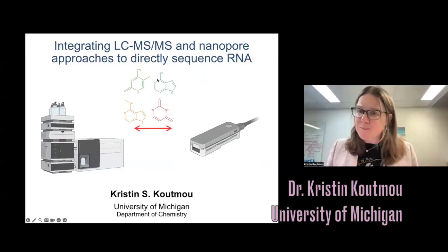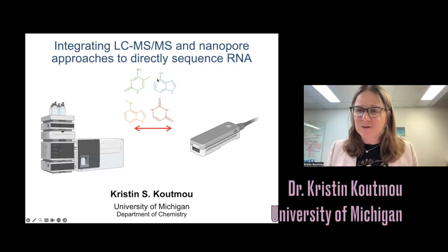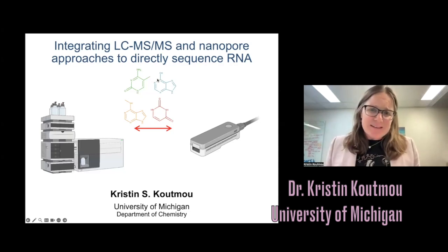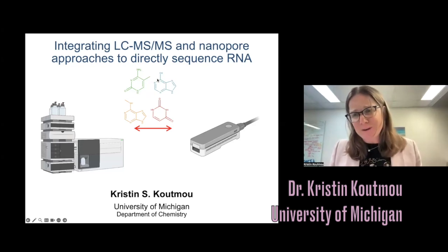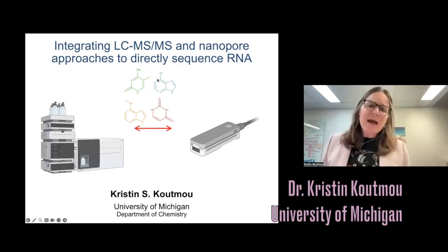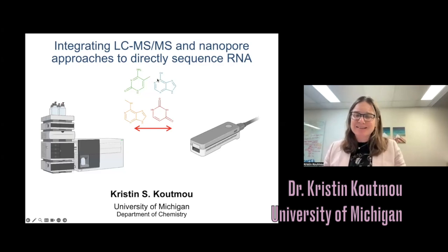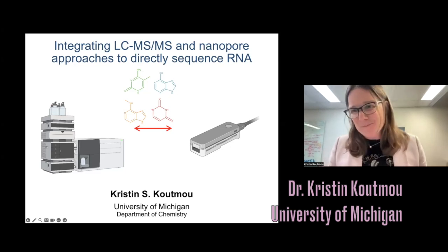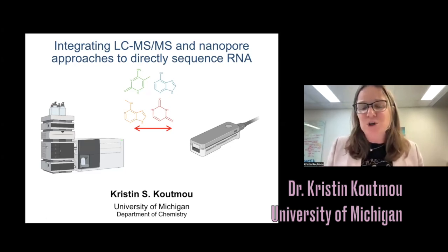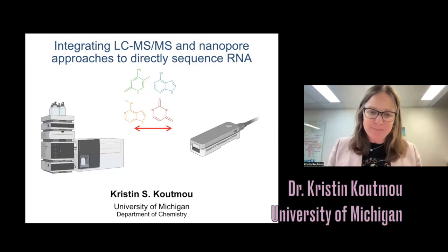And coming from a chemistry background and being in a chemistry department, I said, oh, mass spectrometry must be the way to do this. And luckily, I was smart enough to know mass spec should work and ignorant enough to not know how hard it would be to deal with these long negatively charged oligonucleotides. So I'm going to share with you what has arisen fortuitously out of that ignorance, and my ability to acquire some stellar students and collaborators that have helped my lab push these ideas forward. I want to share with you where we're at this moment in time.